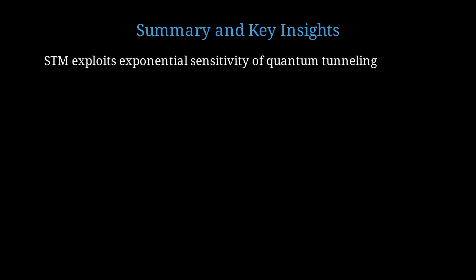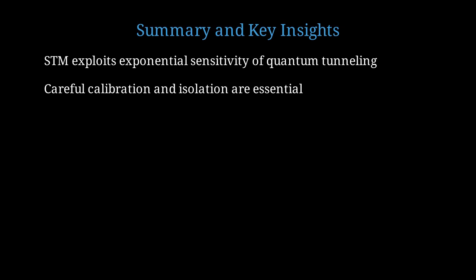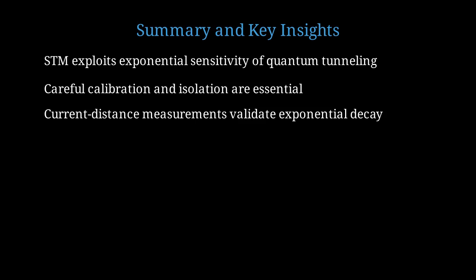Let me summarize the key insights from this workflow. The scanning tunneling microscope exploits the exponential sensitivity of quantum tunneling to achieve atomic resolution without requiring high-energy probes or complex optics. Careful tip calibration and vibration isolation are absolutely essential. Even small vibrations or tip imperfections will destroy atomic resolution. The current versus distance measurement validates the exponential decay and characterizes your specific system. This is not optional, it's a fundamental check.